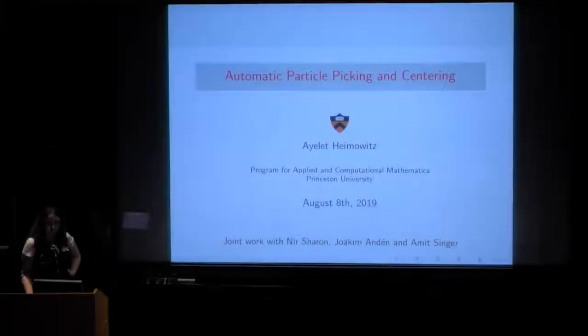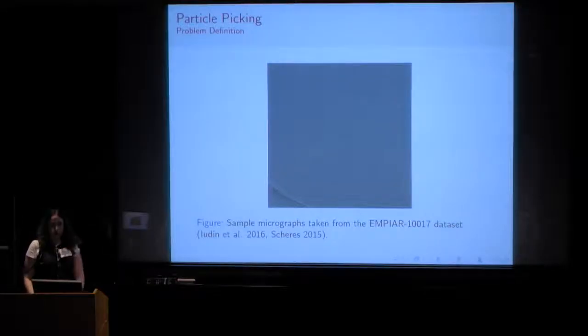Talk about particle picking and about 3 versions of our apple picker. But first, for people who don't know what particle picking is, I'll just give a short explanation.